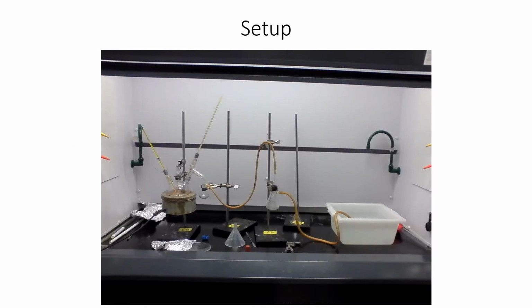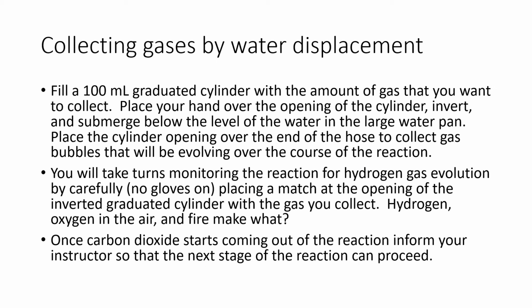This is the picture for the experiment we'll be doing, and the first one is the round bottom flask connected with thermometers. The middle flasks are just flasks to slow down the gases so that we will be able to combust them.